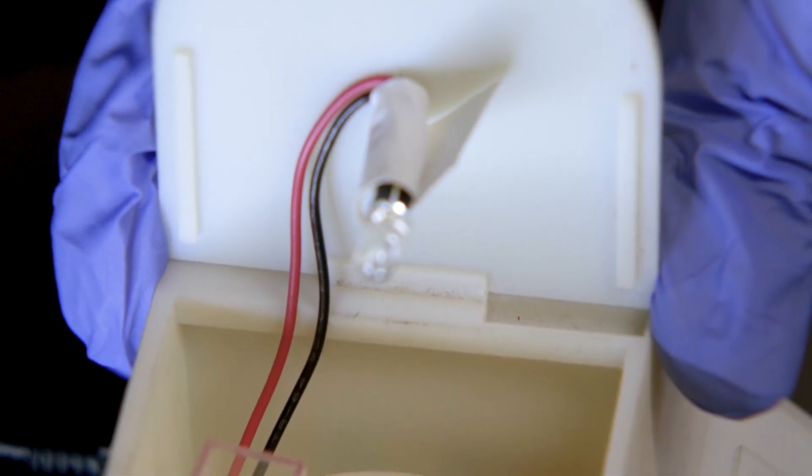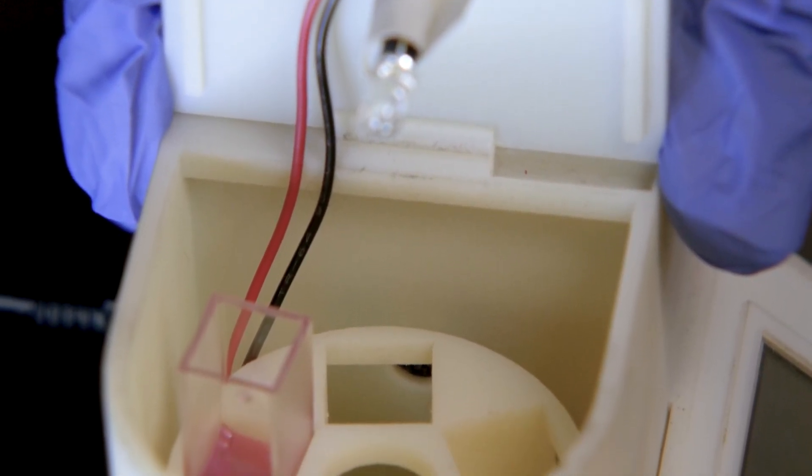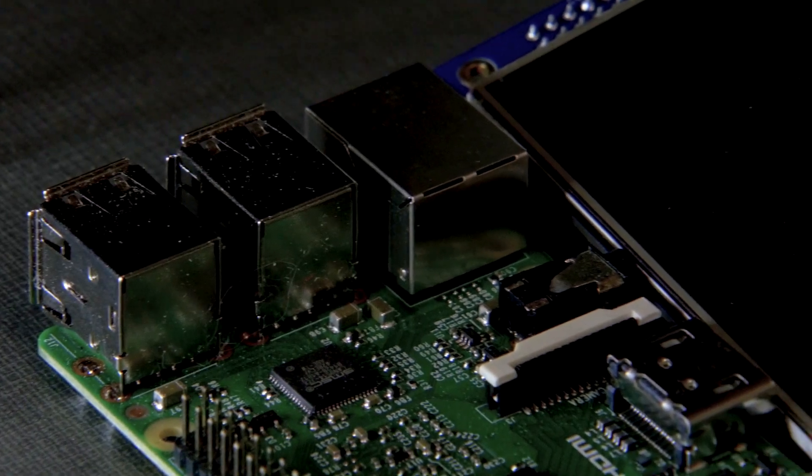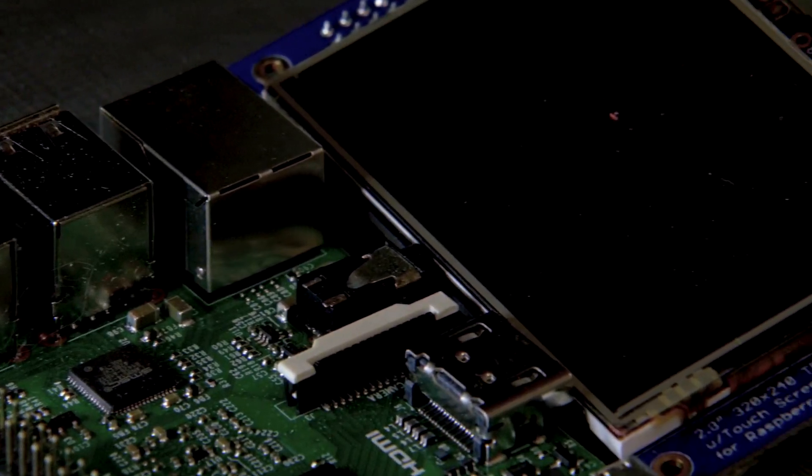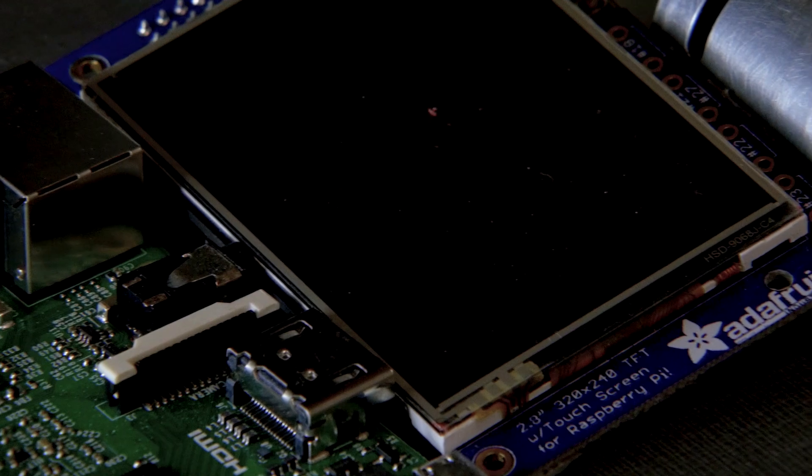The device has a small high-resolution camera and a single board computer, Raspberry Pi, and a rotating disk set on a stepper motor that can analyze five samples at the same time.